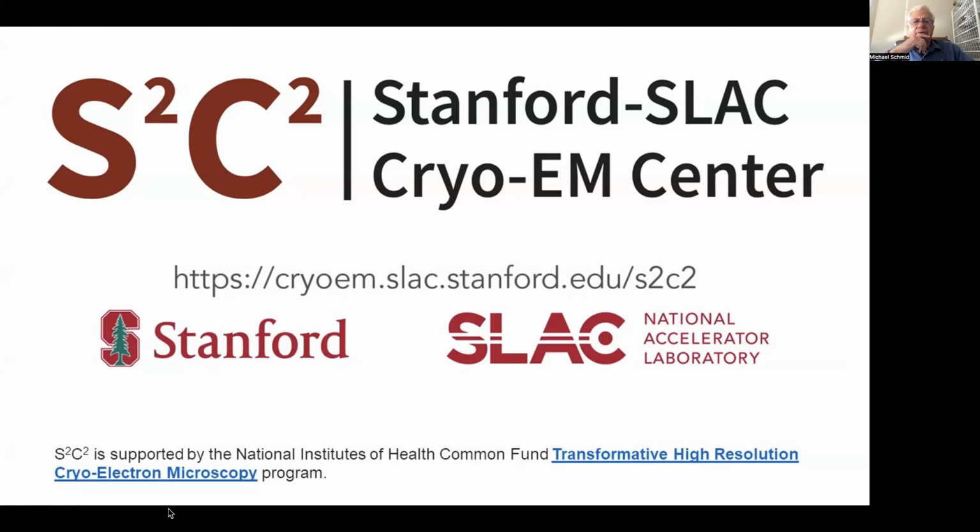I'm Mike Schmidt, and I'm one of the co-directors of the S2C2 CryoEM Center at Stanford SLAC. We have 3 Krioses, one of which has a newly installed cold FEG. They're equipped with K3 or Falcon 4 cameras. We have a Talos Arctica and a newly, well, to be installed Tundra, which is coming on, and another Krios, which will make our full set of 4 Krioses available by the end of the year, or maybe early January.